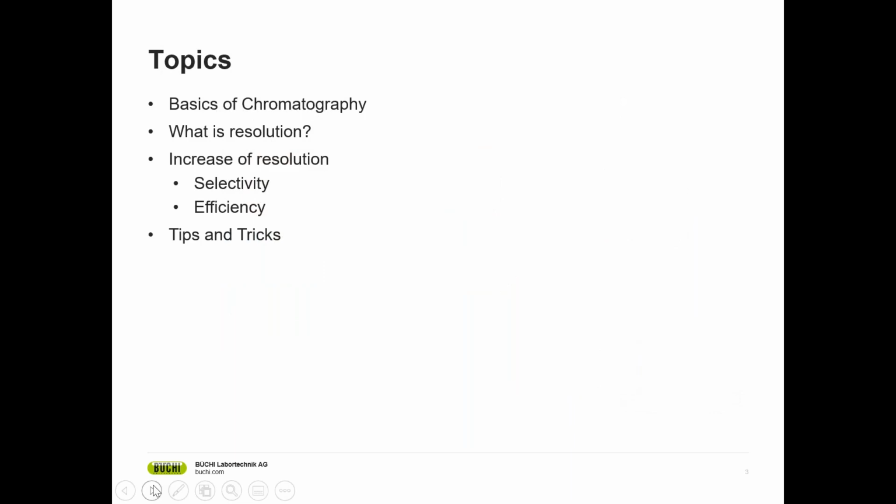In this webinar, I want to touch on the basics of chromatography. Then I would like to show you what parameters resolution is made up of and how to optimize it. And finally, I would like to give you some tips and tricks on how to better separate your compounds.